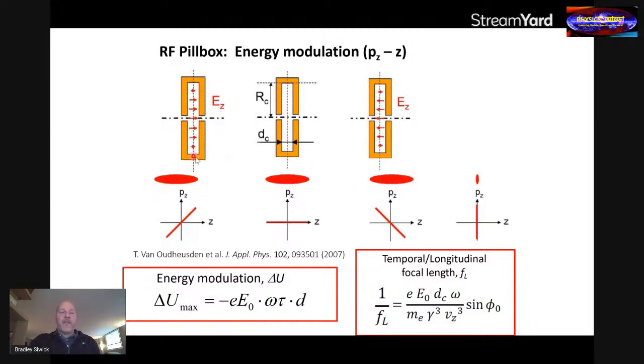In the cavity we have in my lab, the period of the oscillation is 300 picoseconds. Okay, so if I take one of these space charge broadened electron pulses, which have this linear momentum position correlation that I showed you on the previous slide, and I inject it into this RF cavity at exactly the right point in the sinusoidally oscillating cycle, I can arrange things such that the electrons at the front of the pulse see an electric field that slows those electrons down.